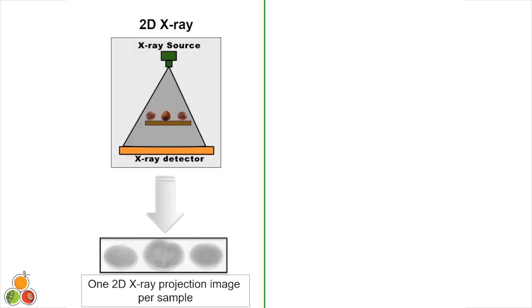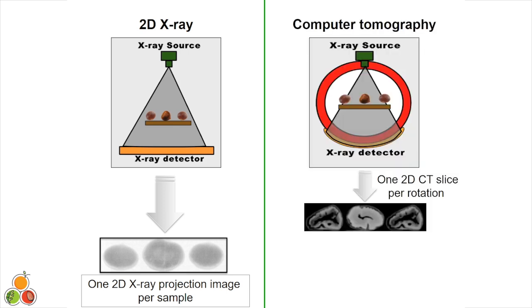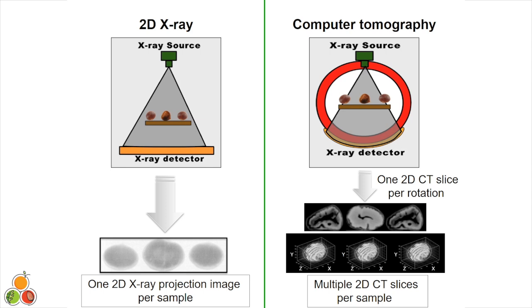2D X-ray, I don't want to go much into it. There is one commercially available system that does 2D X-ray. These were acquired by that system. These are chestnuts. We developed computed tomography techniques, inline computed tomography techniques that could do this. Compared with 2D X-ray, which is one image, CT is multiple images, multiple X-rays around that same item. We could detect void spaces down to the millimeter level using computed tomography. Unfortunately, too expensive, still not commercially available.